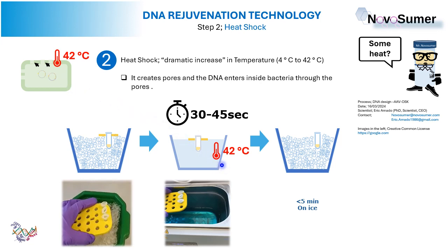So that's what we have done. We expose the cells to 45 seconds at 42 Celsius degrees, and afterwards we return the Eppendorf to the ice. The Eppendorf with the cells with pores and the DNA will rest here for less than 5 minutes.